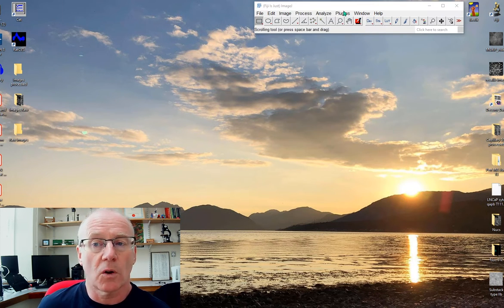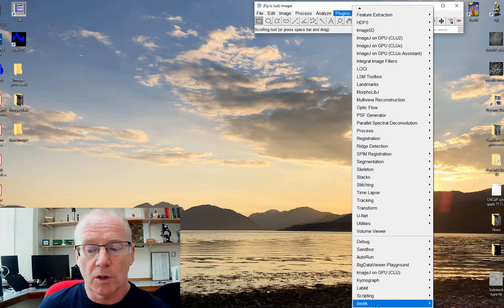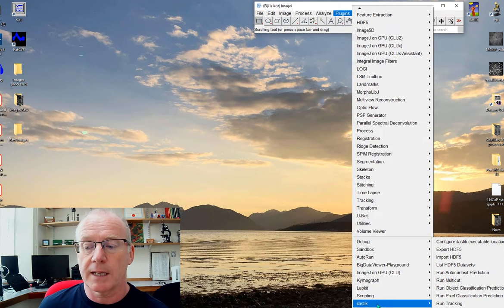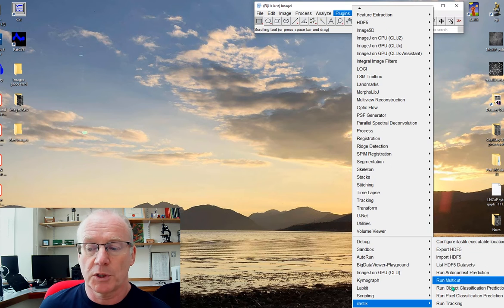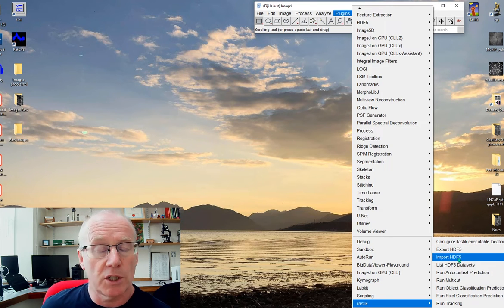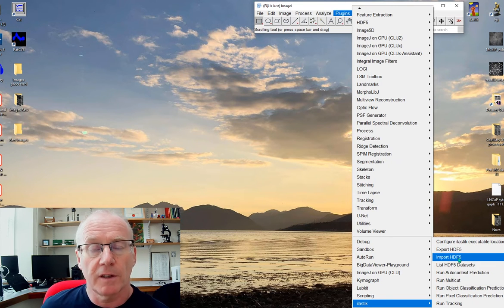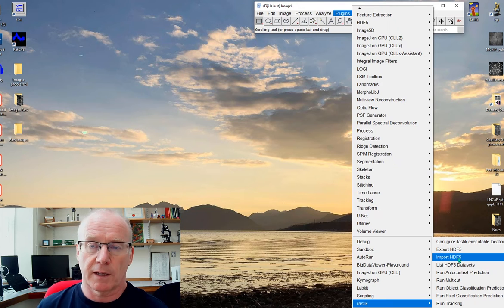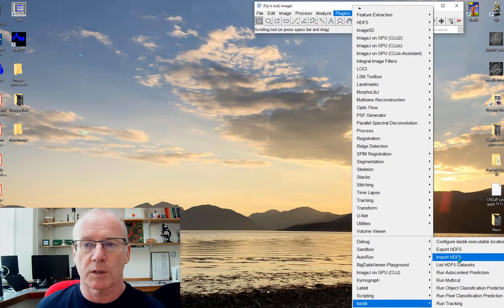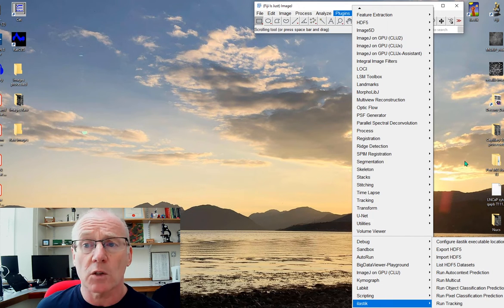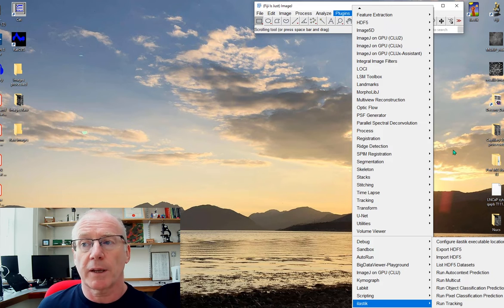Once that is installed, if you go to the plugins menu right down the bottom you'll find Ilastik and there are a bunch of options which include import HDF5. That's the file format that Ilastik will default to exporting as and that's why we need the Ilastik plugin.